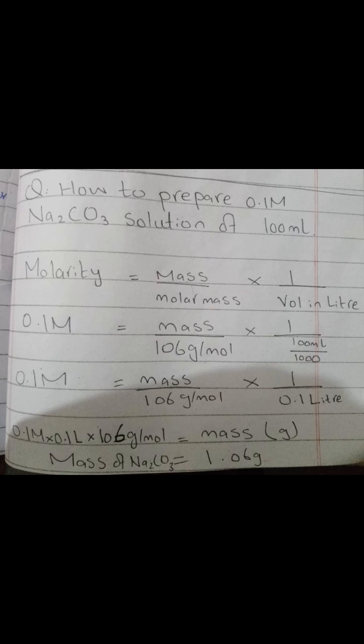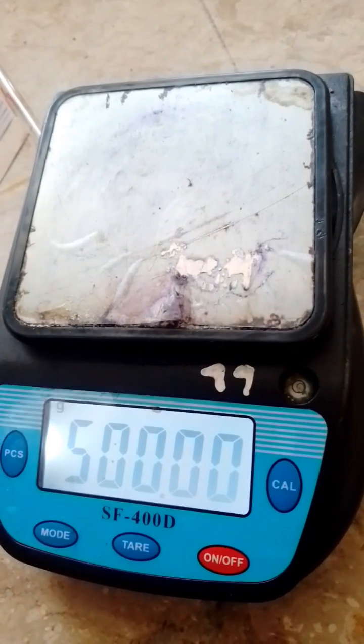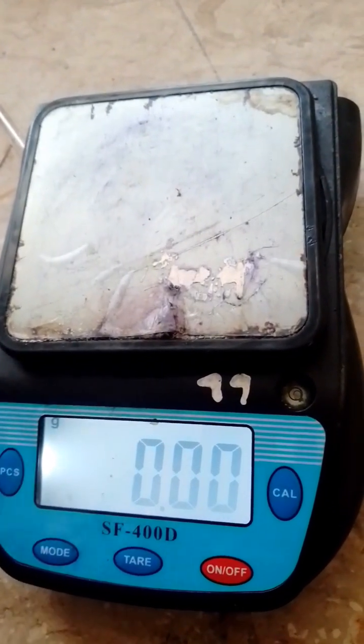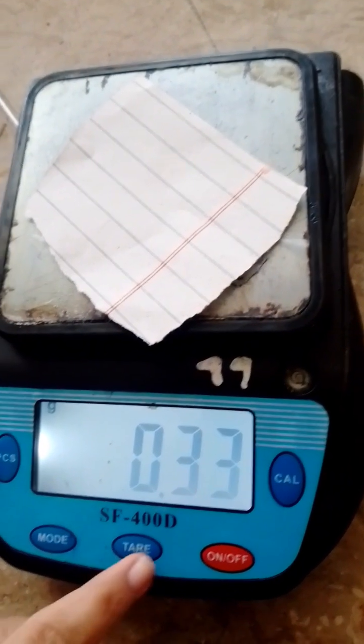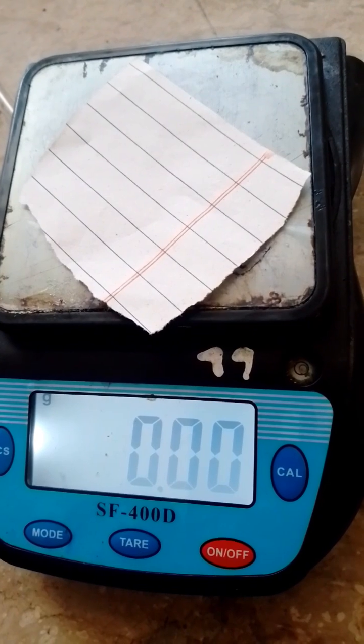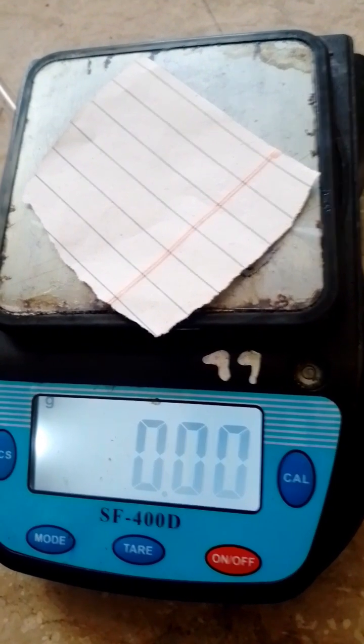For this, we divide 100 ml by 1000. And putting the value of molar mass of 106 gram per mole, we calculate the mass of sodium carbonate. Then take a weighing balance and place the paper on it and tare it to eliminate the weight of the paper.